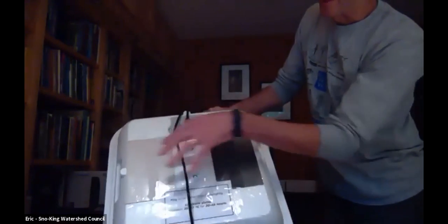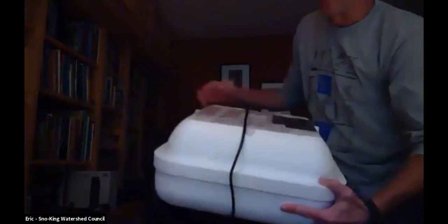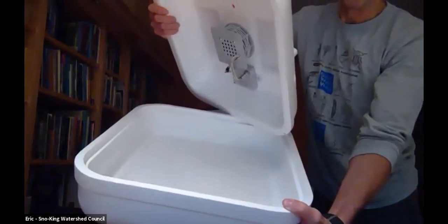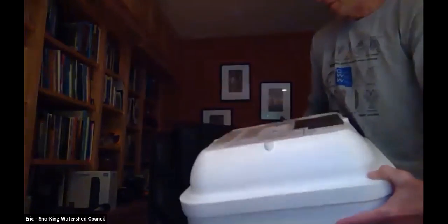It comes with windows. It's an egg incubator, but basically it's got a thermostat. And so we just plug this thing in, open it up, and put our dishes inside of it. And then what's nice about this is you can program in, and we pre-program these with the set temperature.